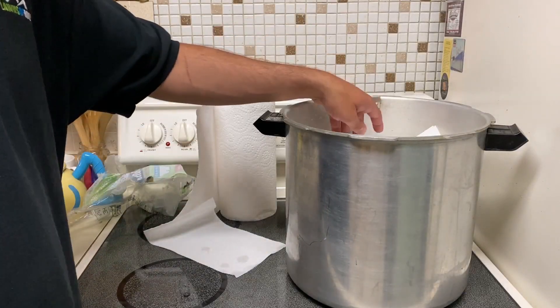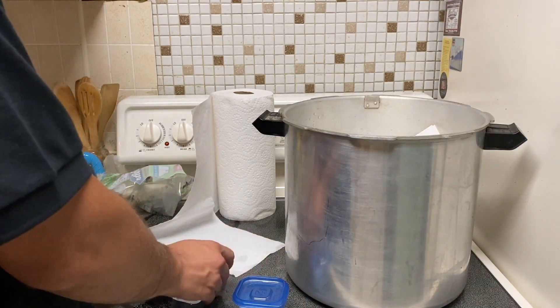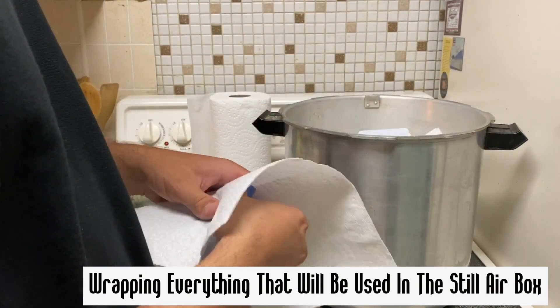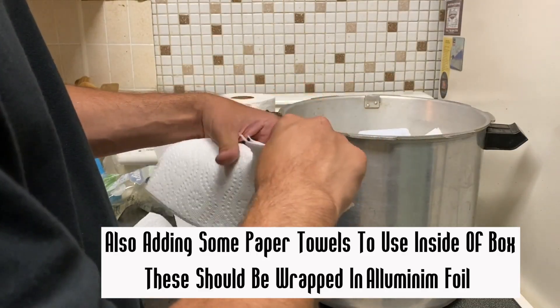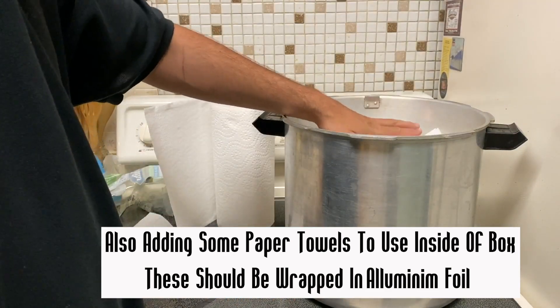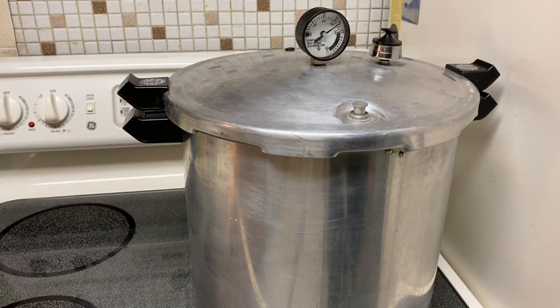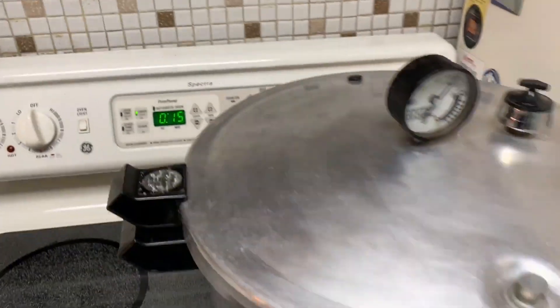I also have a graduated cylinder in there, a small milliliter measurer, and two little Tupperwares of distilled water — just small shaking containers of sterilized water inside the box. It's also good to have some sterilized paper towels: fold them up, put some aluminum foil around them, and sterilize them so you can move them into the still air box later. Next I put the heat up on max until the pressure cooker reaches 15 psi. Once it hits 15 psi I turn down the heat about halfway just to keep that level temperature, and then let it pressure cook for 15 minutes at 15 psi.